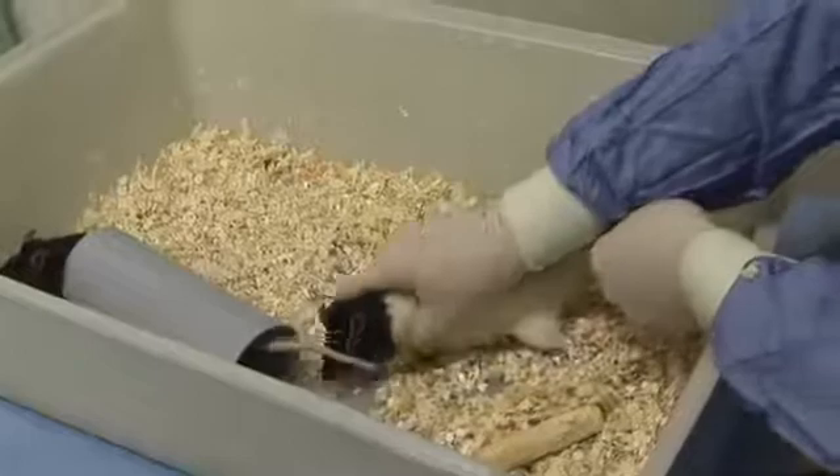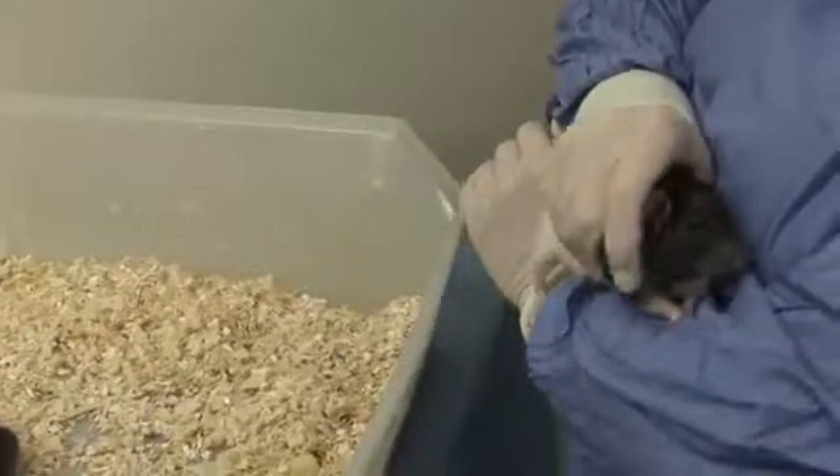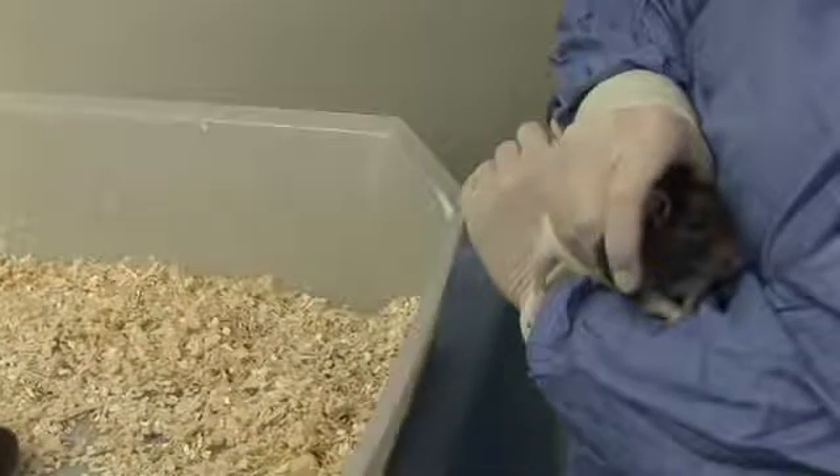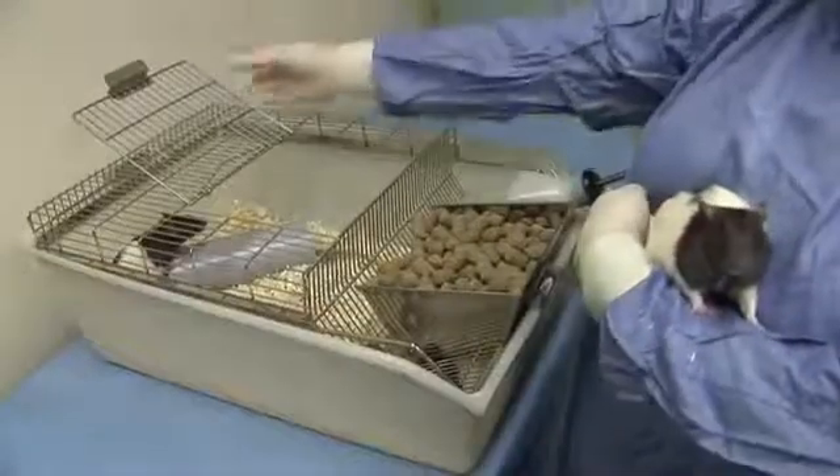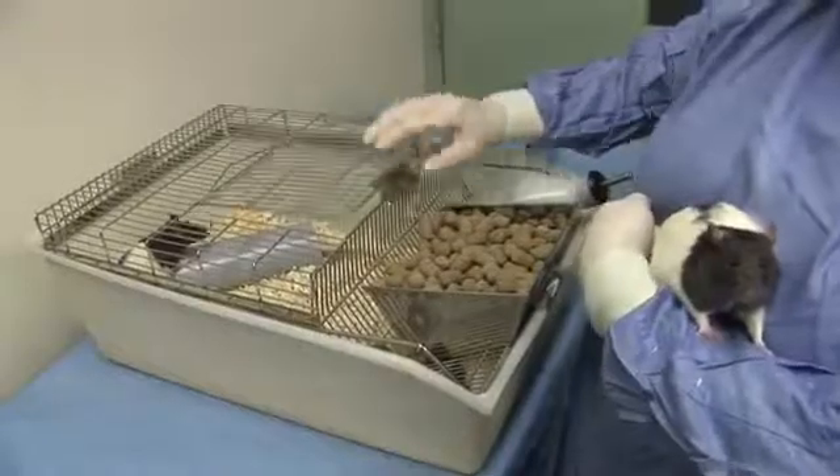It can then be held resting against your chest or arm while maintaining a gentle grasp around the shoulders and with the hindquarters supported. The cage lid may need to be replaced to avoid other animals climbing out of the cage.